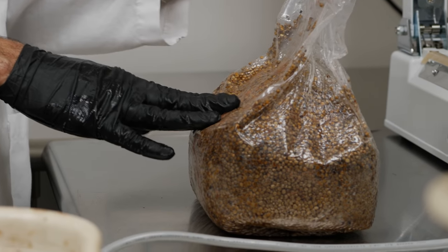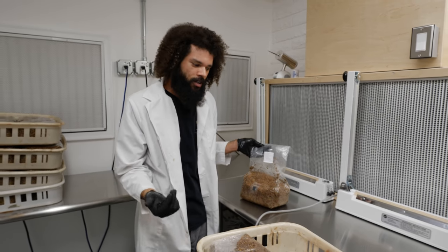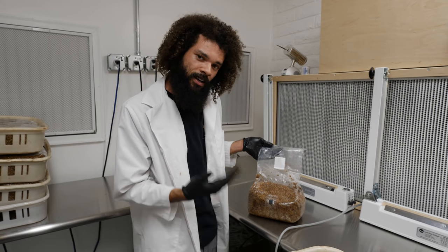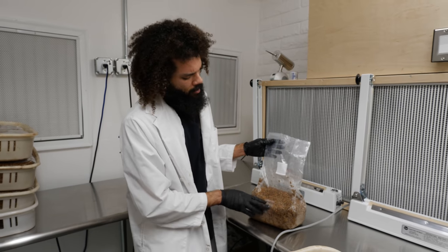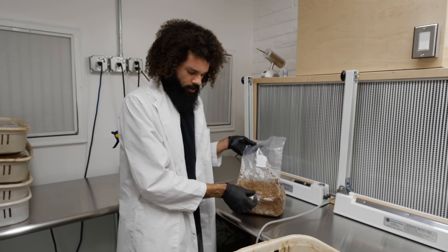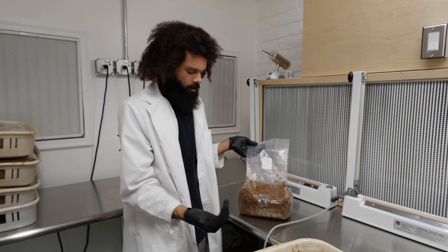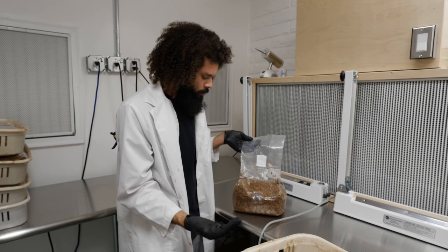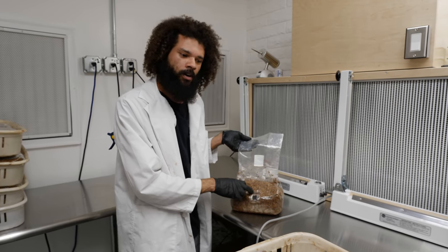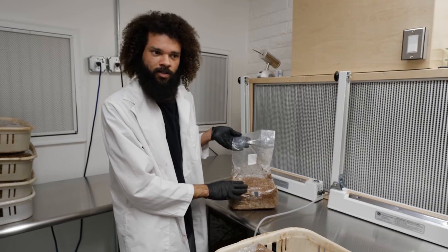This is just sterile grain at this point — it hasn't been turned into actual spawn yet. All it needs is a fresh mushroom culture, either from a petri dish or liquid culture, or you could even use spores to germinate and start mycelium. These bags have an injection port, which is great for people that don't have a laboratory or a flow hood — you just need a syringe of culture, flame sterilize it, and inject through the injection port to grow out your own spawn.